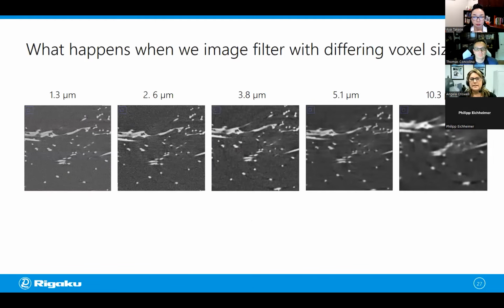So now let's zoom out and look at a broader view of this same media and ask, okay, we talked about estimating fiber size. How about our resolving power for these fibers? In this case, we'll consider a couple of fibers that are close together in the bottom half of these little selected 2D cross sections.